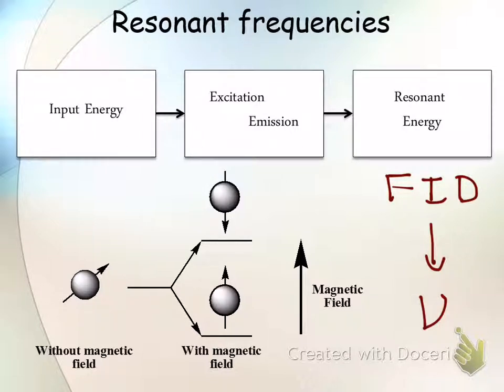deuterated. See, everybody laughs when I say that. What does that mean? It has deuterium for the hydrogen. So if you use a solvent that has hydrogen in it, all you're going to see is the hydrogens from the solvent. You'll be like, where are all these gigantic peaks? Where's my product? So we use deuterated solvents so that we don't have to look at the solvent signals.